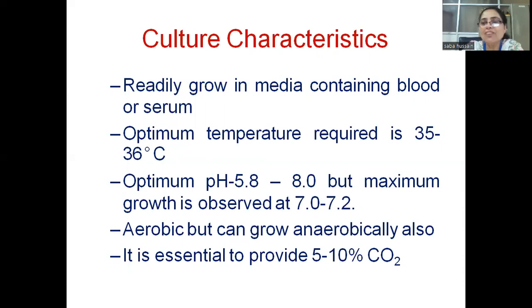We have added trimethoprim in this to avoid Proteus species, because Proteus species also causes urinary tract infections. So that is why, to isolate this bacteria, I'm talking about when I was talking about Thayer-Martin media, I forgot to discuss this.